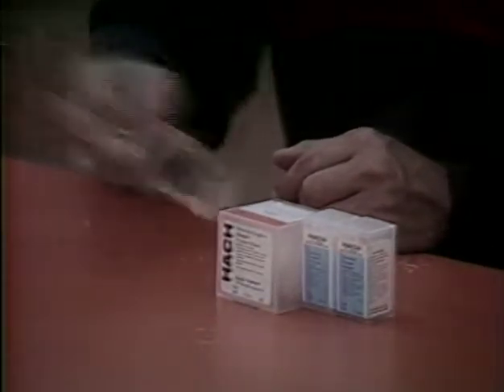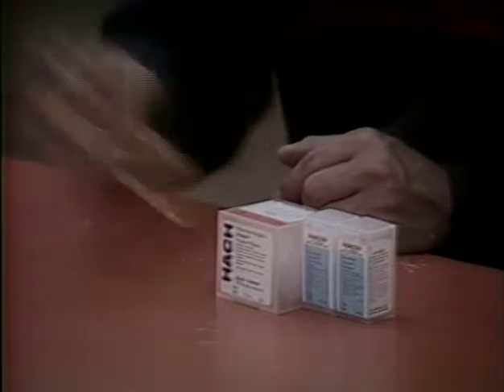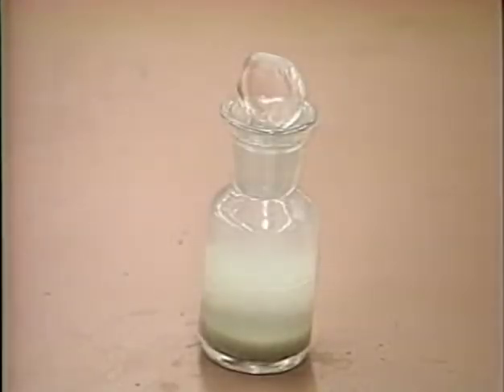A flock will form, which will be brownish-orange if oxygen is present. Allow the sample to stand undisturbed until the flock has settled to the lower half of the bottle. Then shake the bottle again and allow the flock to resettle a second time below the line on the bottle.